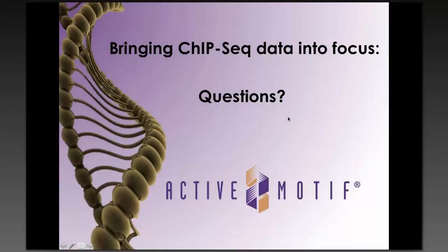Sort of going along with that, the quantification of the human and Drosophila chromatin must be pretty important for this. How are you guys quantifying that? I'm assuming that means how do we quantify the amount of chromatin going into each reaction? Yeah. So once we prepare the chromatin, we take out small aliquots of that chromatin, reverse the cross-links, precipitate the DNA, and quantitate the amount of DNA that's coming out. So it's actually not a quantitation of chromatin protein, but a quantitation of the DNA.